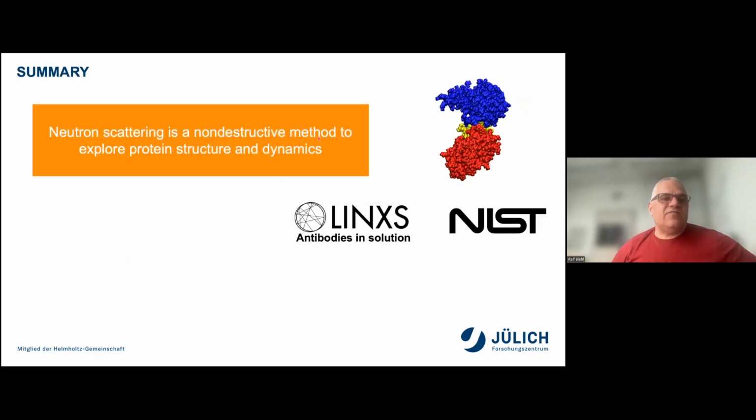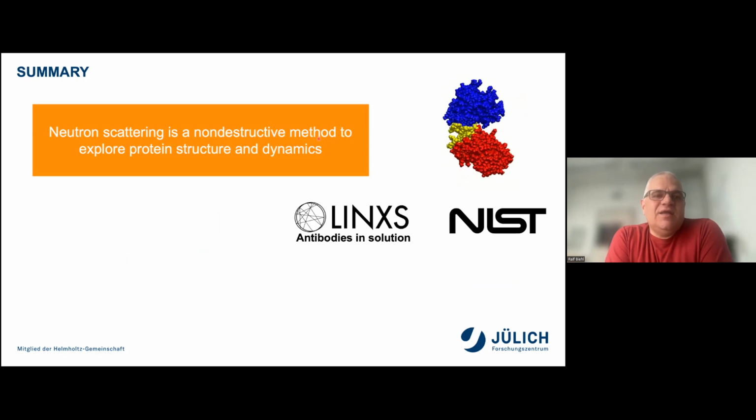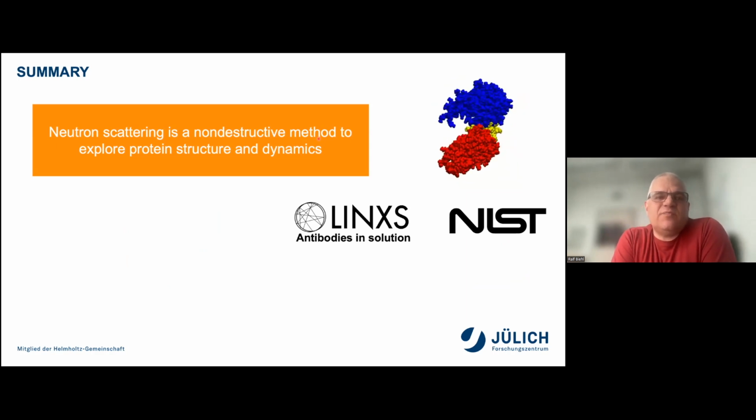With that, I want to end, with only a very short summary: neutron scattering is really a non-destructive method that can explore protein structure and dynamics.